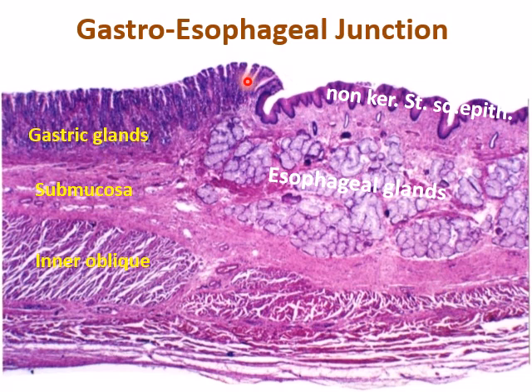While here, near the stomach part, I'm having a change of the epithelium from non-keratinized into simple columnar, and I'm having gastric glands. I'm having pits, having crowded glands. The submucosa does not contain glands as that of the esophagus. In the muscle layer starts to appear an additional muscle layer: inner oblique, middle circular, outer longitudinal.